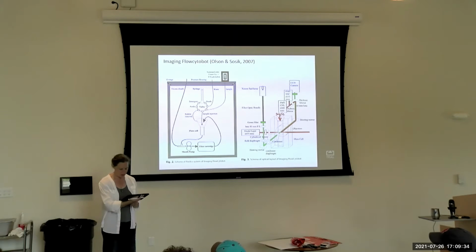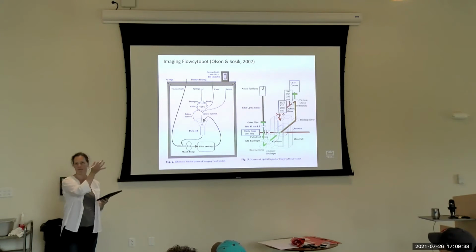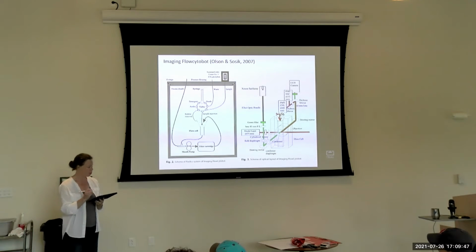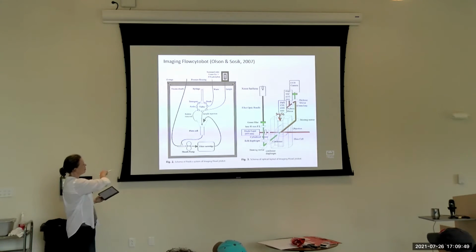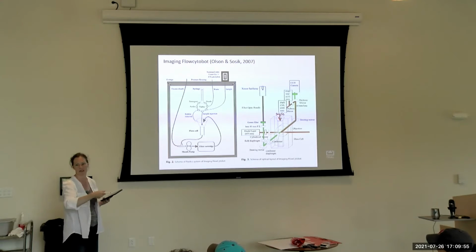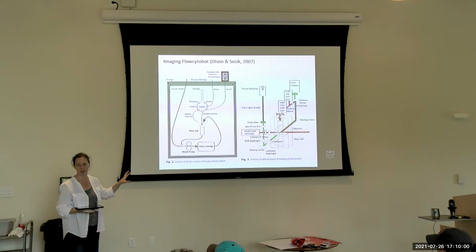Also, I should mention, you can see from the way that this is set up, as I showed a couple slides back, before lunch, the IFCB is using transmitted light imagery. So we've got the green line entering the flow path through the condenser, passing through the cell and being scattered by the cell. We're picking up what's coming out the other side. So this is sort of analogous to bright field microscopy.